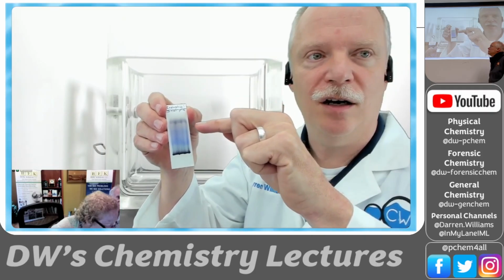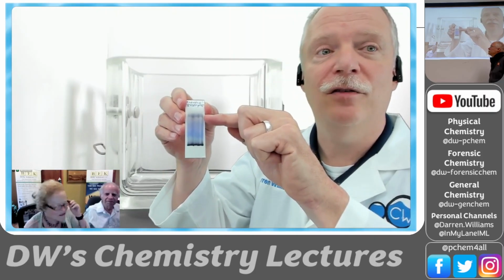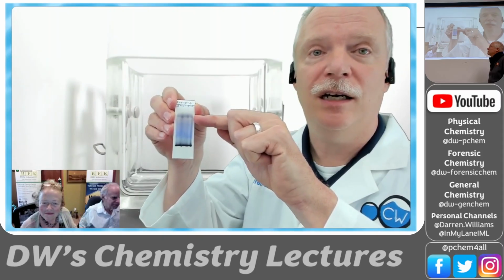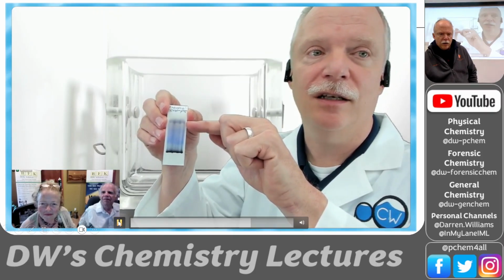So this dark line right here will always come out at that ratio. It will have a ratio of about 75%, so 0.75 of that distance will be this particular substance's retention time or distance traveled in thin layer.